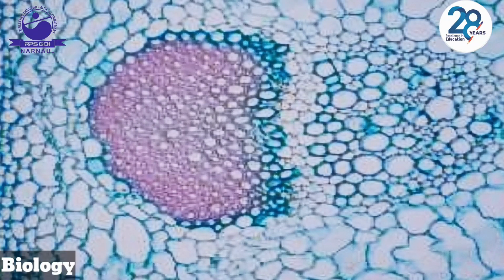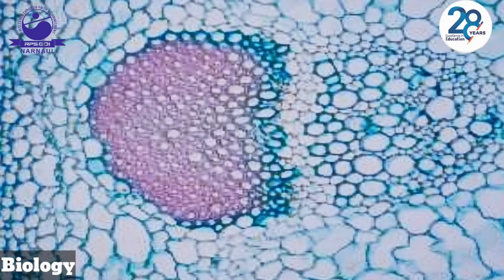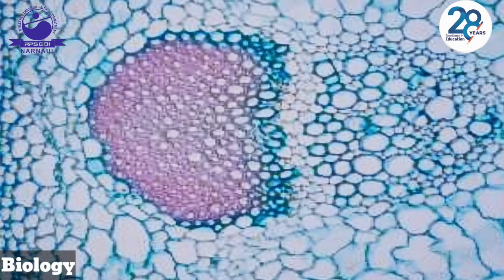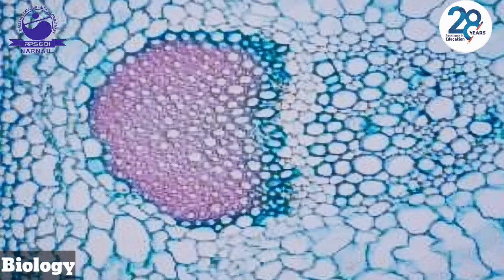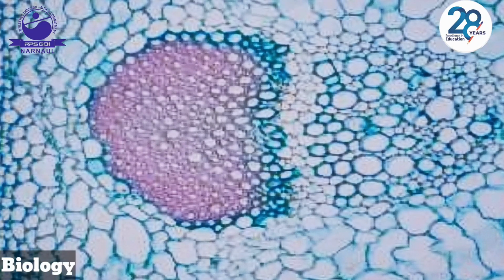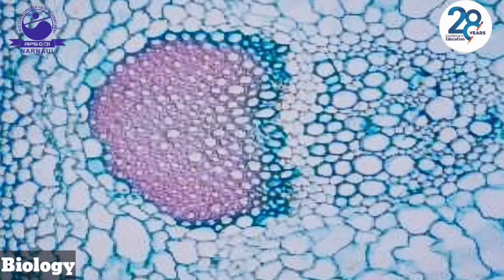Another is the phloem. Phloem consists of sieve tubes, companion cells, phloem parenchyma and phloem fiber. Sieve tubes, companion cells and phloem parenchyma are living cells, while phloem fiber is dead. It must be clear that it is not a mechanical tissue. Phloem is responsible for the conduction of organic solutes. Generally, it is located towards the outer side of the plant part.